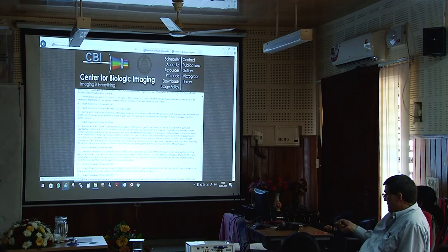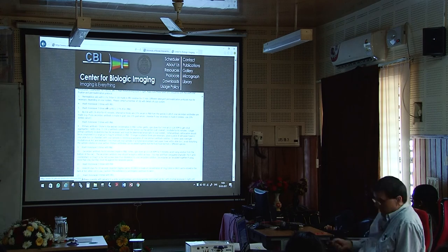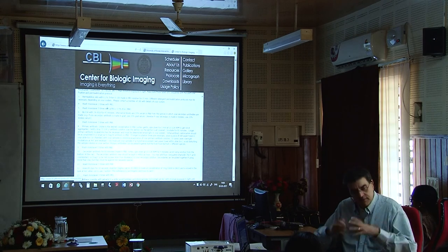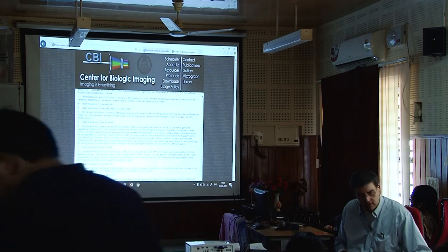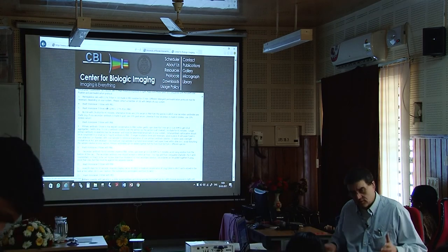And the whole idea, again, is to keep it wet. So like it says here, if longer incubation times are necessary, place a piece of wet paper towel in your slide box. So again, you want to keep everything wet. You don't want things to dry out. So put a wet piece of paper towel down, put your slide on top of it if you're going to let it go overnight so it doesn't dry out.